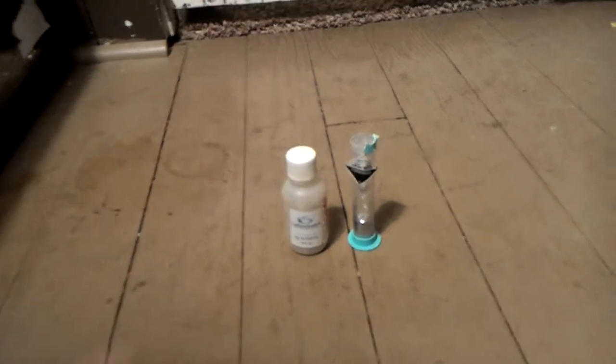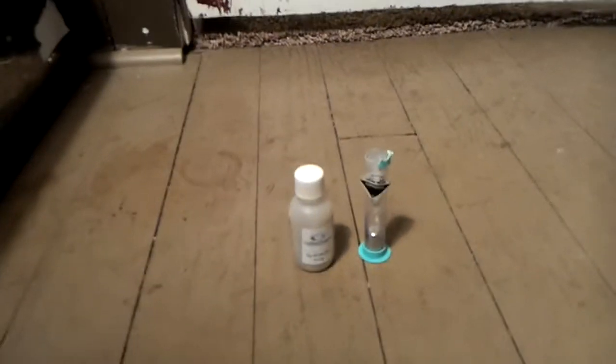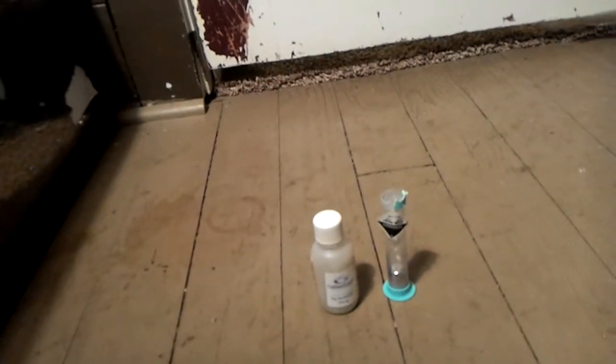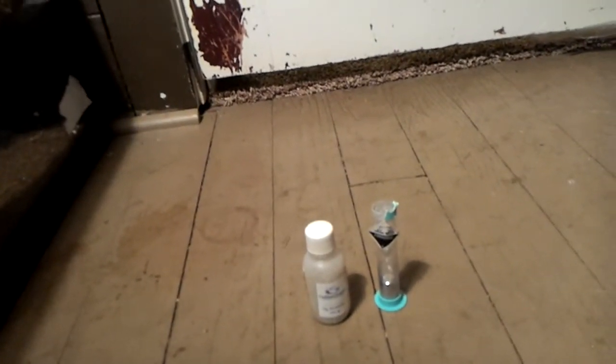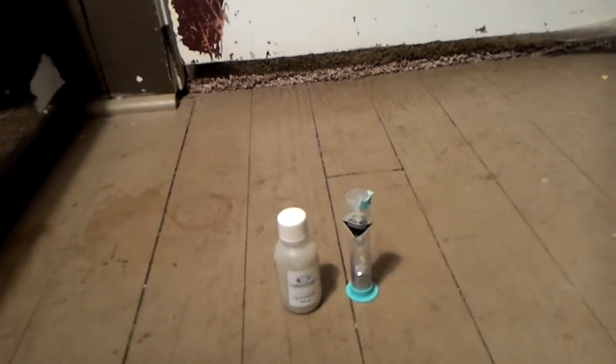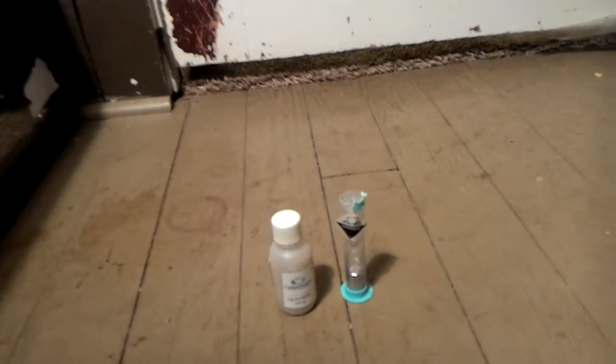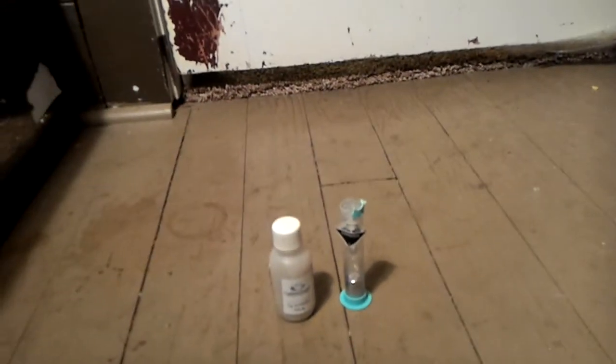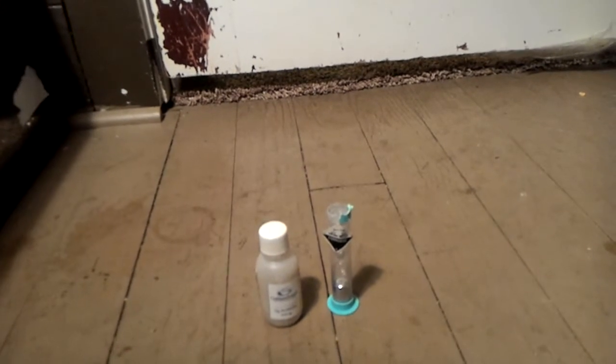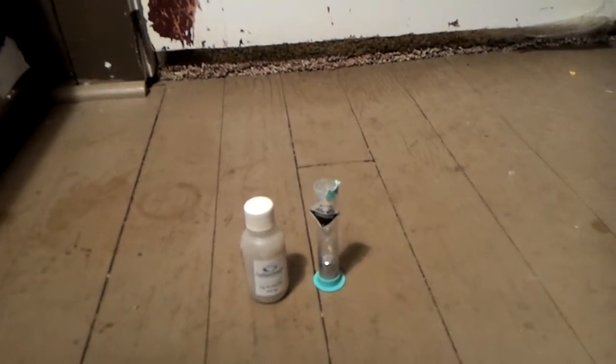But, it gets really nasty really quick. Like, I removed all the mercury out of this, and there's still some kind of nasty compound in there. I think it's an oxide of some kind. It might pull the oxygen through the plastic, or it might react with the plastic. And that's a huge con, because then you'll have to clean it, like in my mercury cleaning video. And it's kind of a big hassle that nobody wants to do.